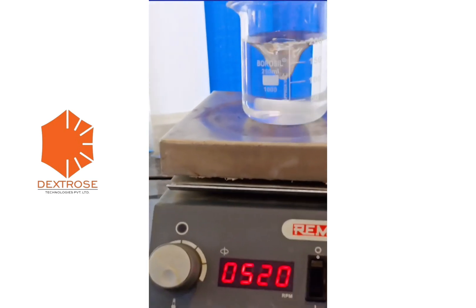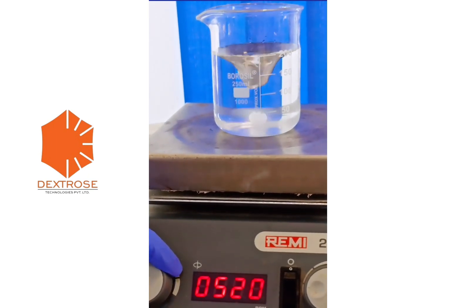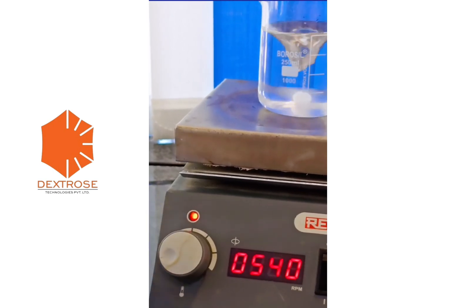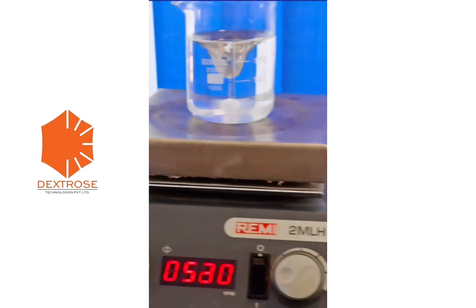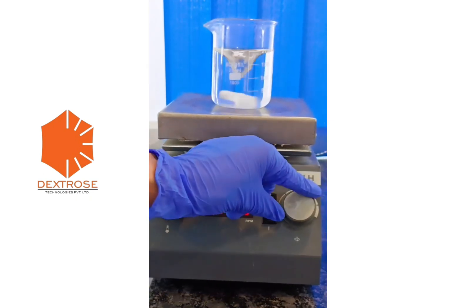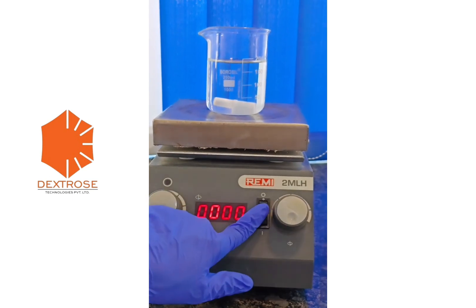If you want the temperature to be increased, you can also increase the temperature with the help of the temperature knob. After mixing, just reduce the speed to zero and turn off the button.